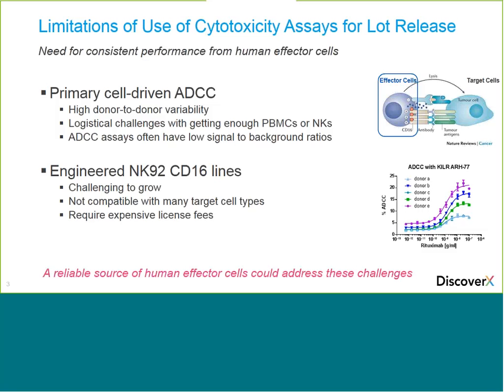So from this perspective, to use a cytotoxicity assay reflective of the MOA of ADCC in lot release is challenging unless one can identify a reliable source of human effector cells that could address these challenges.